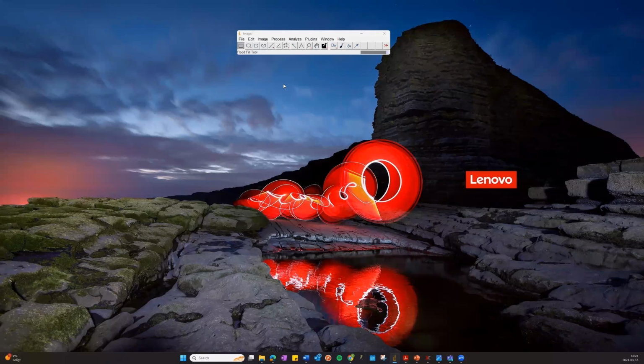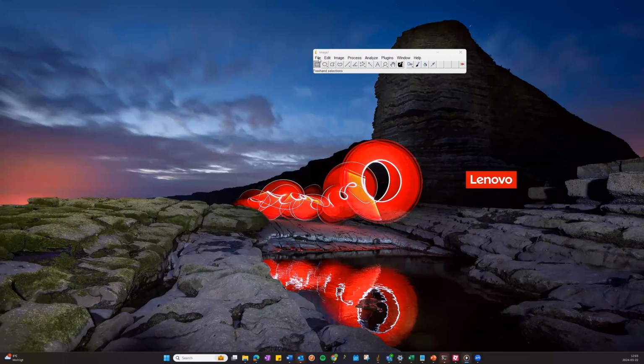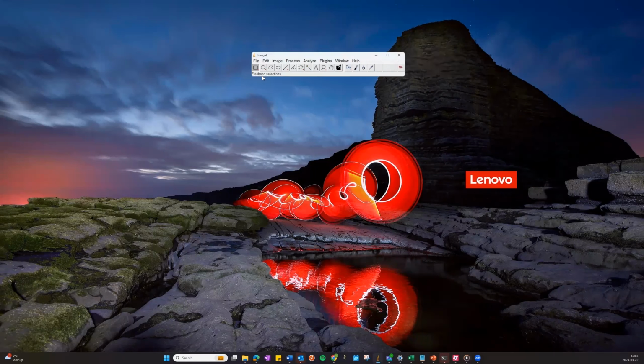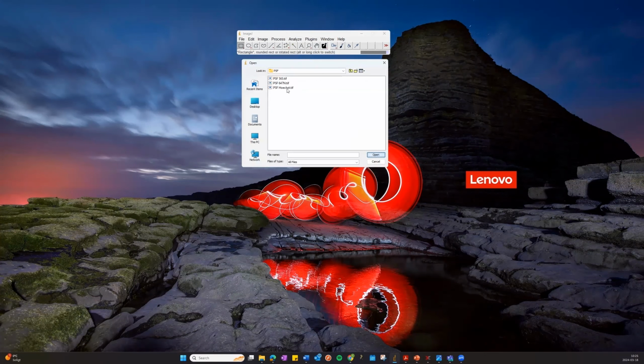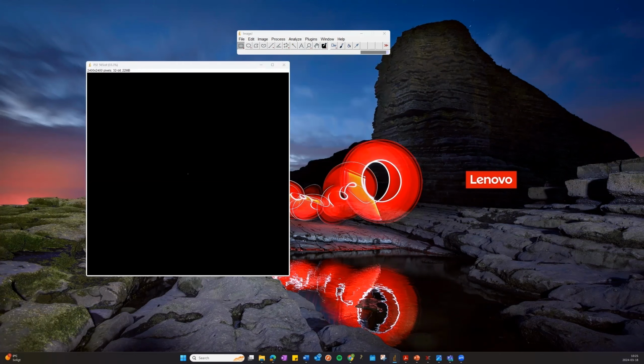So when we have exported our images, we have created our PSF images. So now we want to perform the 2D deconvolution. The first thing is to open your PSF image. So, file, open. And in the folder where you saved your PSF images, we have to do every channel separately. So we start off with the 565 channel PSF. And then we need to open the grayscale TIFFs that correspond to the Atto 565 channel. So that's the files ending with channel 01. Open.